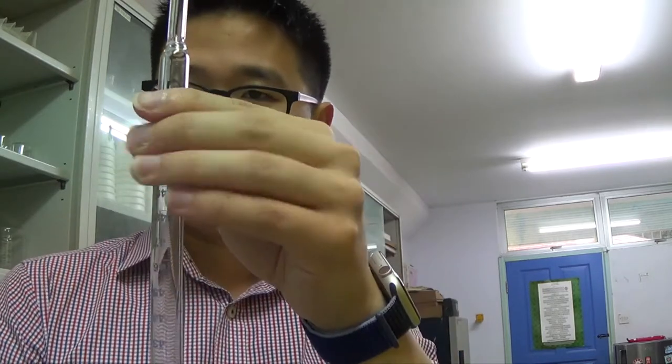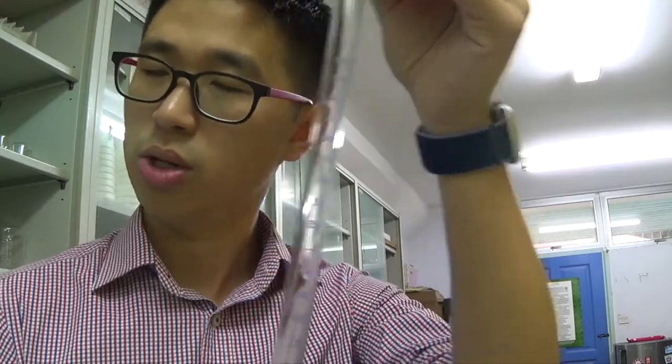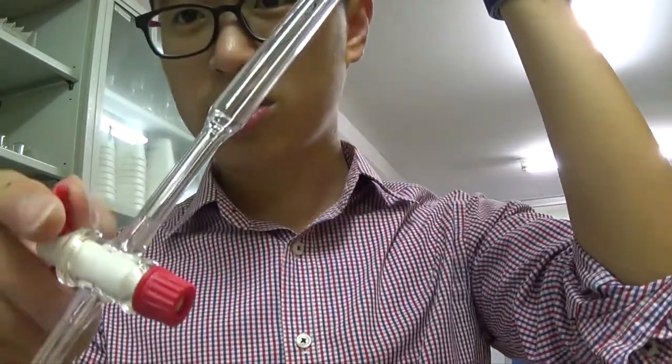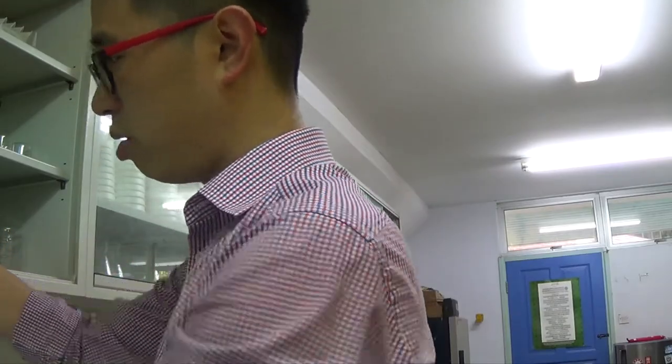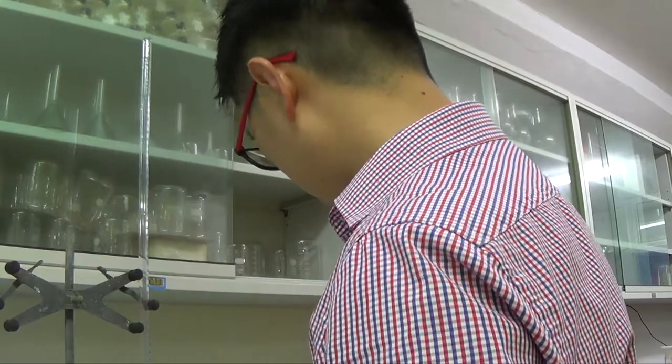We also want to make sure that it's as dry as possible. At least it was washed with distilled water already. If you have a lot of distilled water in there, that can affect your concentration. Make sure the tap is closed, so that when you fill it in, it won't spill out. So you hold it. I have my burette held on a retort stand here.